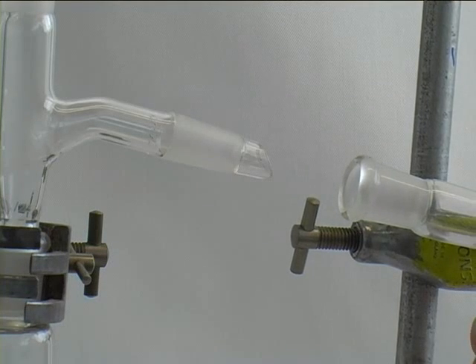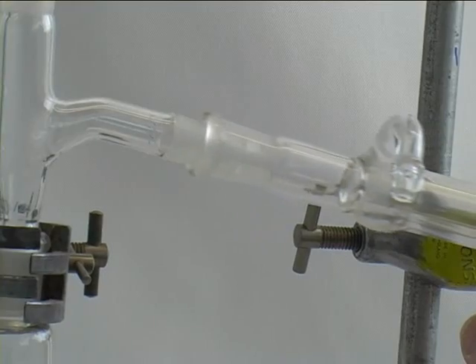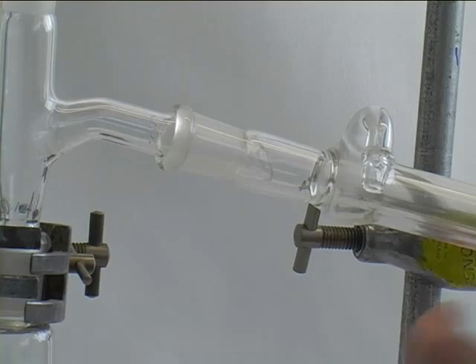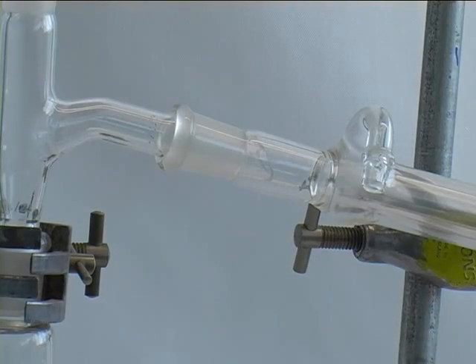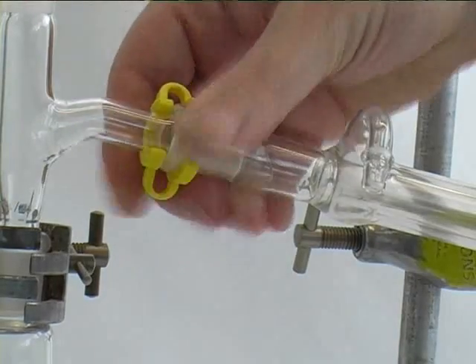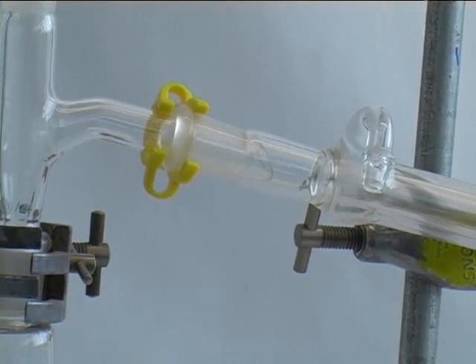Once you have aligned the whole apparatus, you just open the clamp on the condenser and slide the condenser over the joint of the still head. Then you fix the clamp again and affix the still head to the condenser using a yellow joint clip.